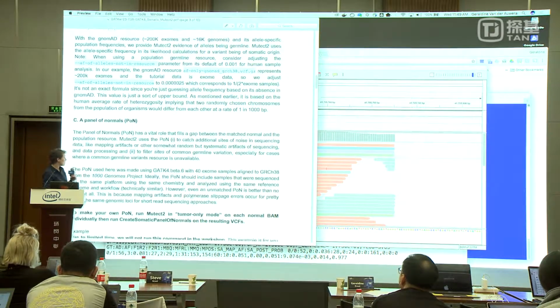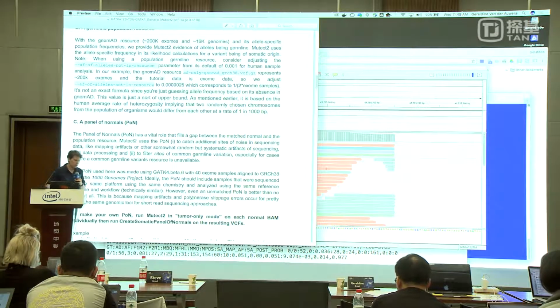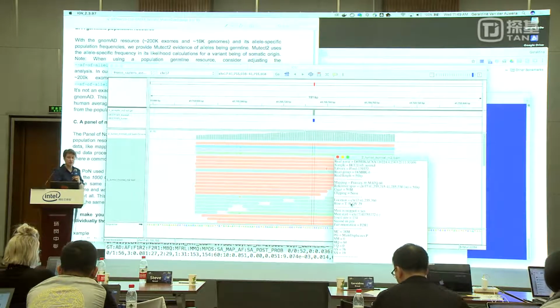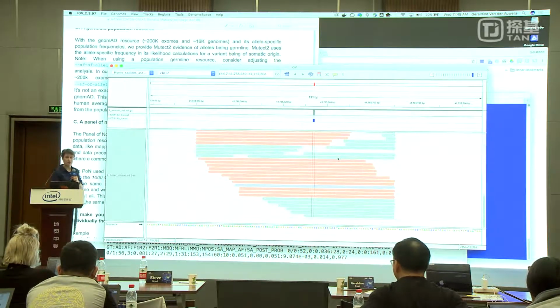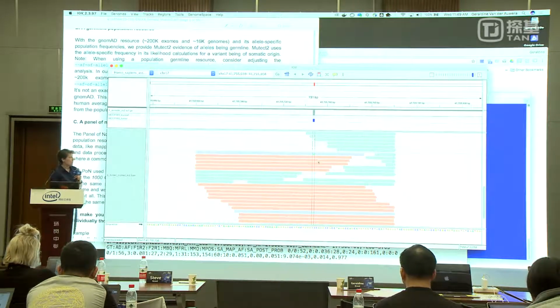Now let's talk a little bit about the panel of normals. The panel of normals is what we're going to be relying on to remove artifacts. For example, here, I'm not saying this is an artifact. I haven't looked very closely at this site. This is a site that I just chose randomly as we were starting up. This is very low frequency. We have 2 reads. With just 2 reads out of the file, it's very possible that it's a technical artifact.